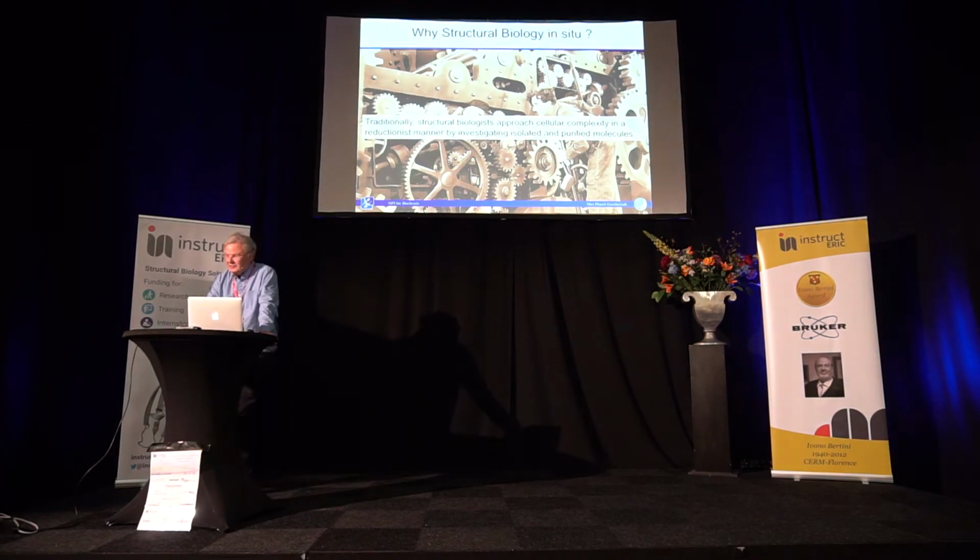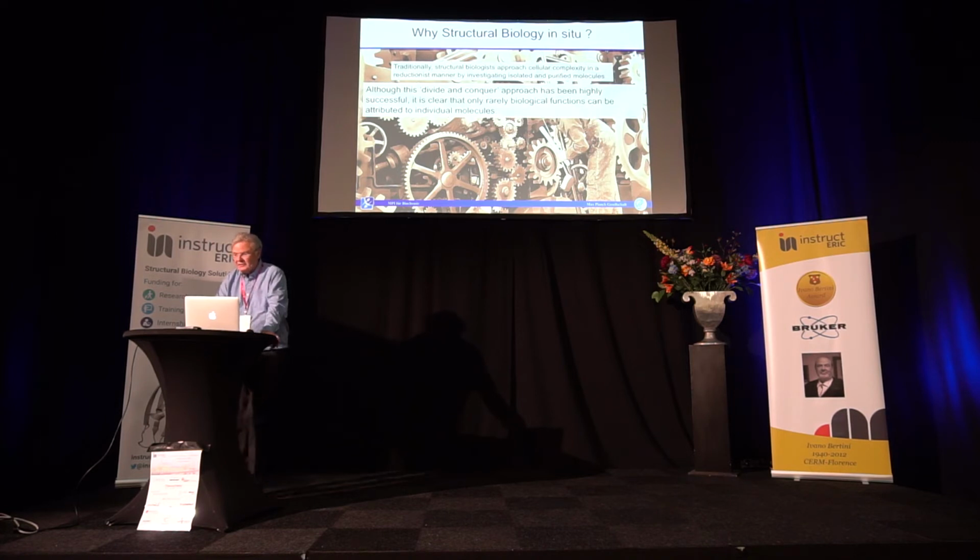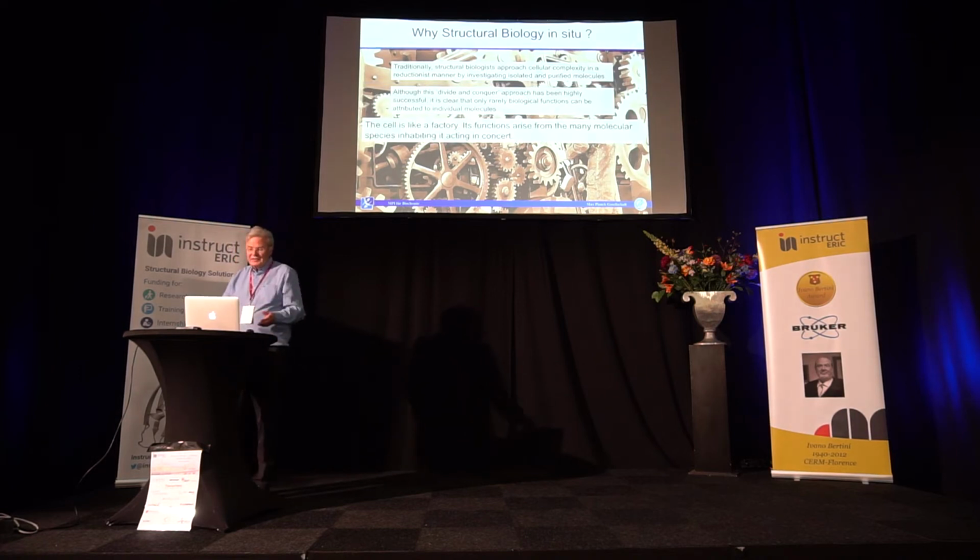That is, why do we want to do structural biology in situ? I think it's fair to say that traditionally structural biology takes the reductionist approach. Cells are taken apart, the molecular components are fractionated, they are purified, or they are made recombinantly, and they are studied one by one by the repertoire of tools structural biology has at its disposal. Now, I think it's also clear that this divide and conquer approach has been tremendously successful if you look at the PDB, but it's also clear that biological functions are hardly ever performed by individual molecules. They arise from the interactions between the many molecules that are inhabiting cells. So it's the interactions that drive cellular functions.